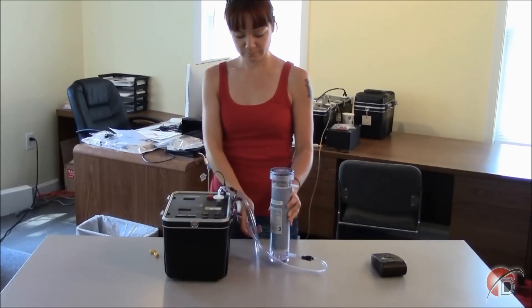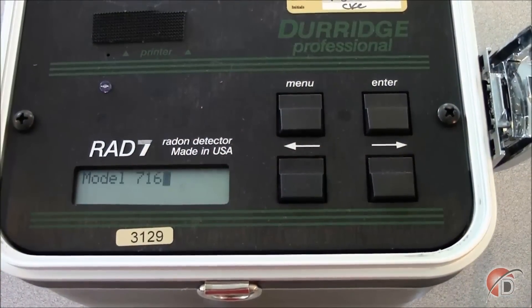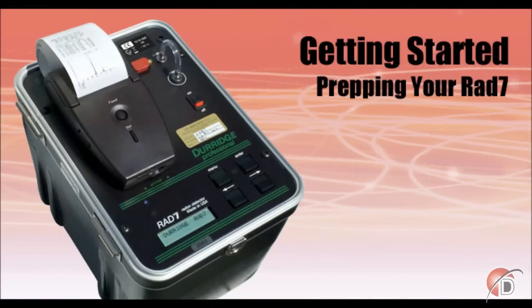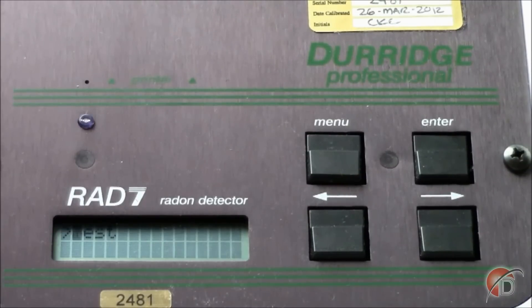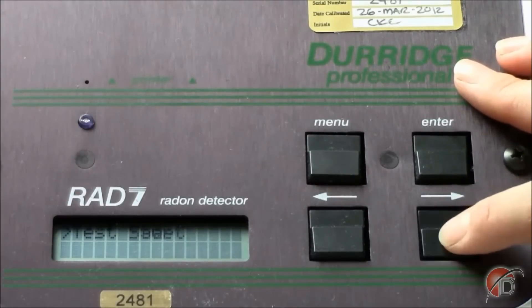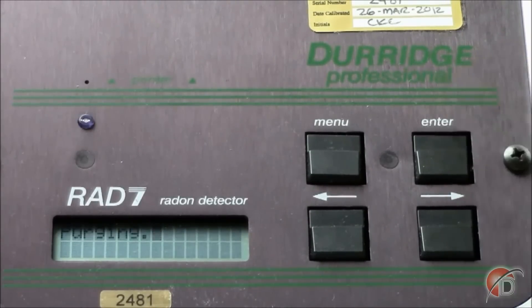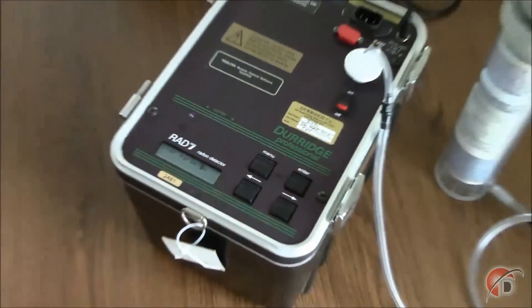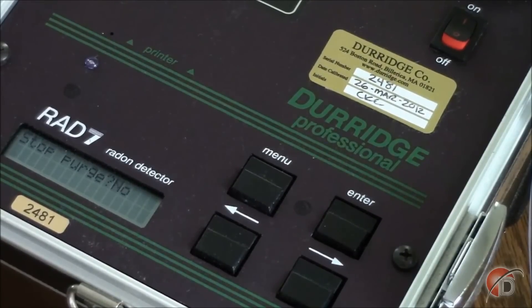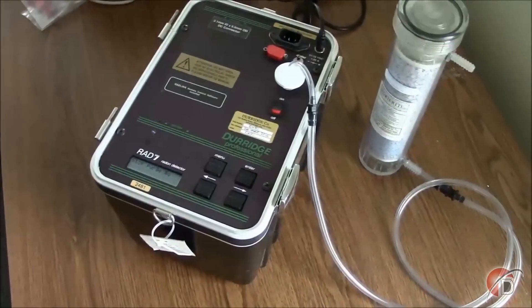Since our RAD7 is already plugged in, we may turn it on. As the RAD7 initializes, you should see the parameters of its last use display across the screen. You may skip this display by pressing the menu button. When the RAD7 is finished initializing, the test screen is displayed. From this screen, press Enter and arrow over to Purge, then press Enter. If you listen closely to your RAD7, you should hear the pump start. Your RAD7 is now drawing in atmospheric air through the desiccant and into its chamber, and emitting the spent air back through its outlet. The RAD7 display will say Stop Purge, but we won't push any buttons until we're actually ready to begin the one-day test.